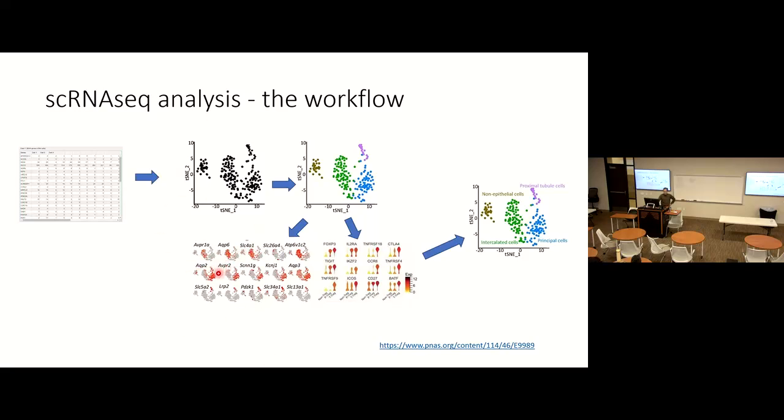So those are the examples. For example, AQP2 and these rows of data are highly expressed in the blue cells. And the last row, these genes are expressed in purple. Once you have identified that information, you can start to synthesize your understanding of the biological system.